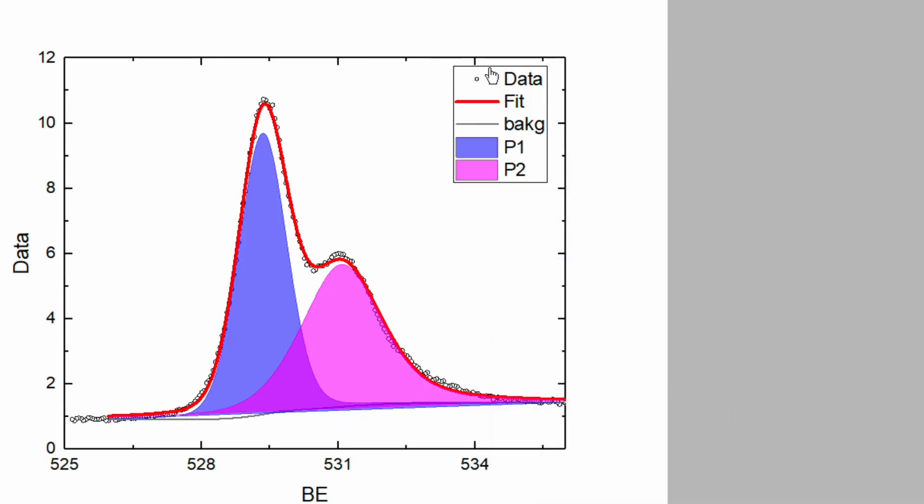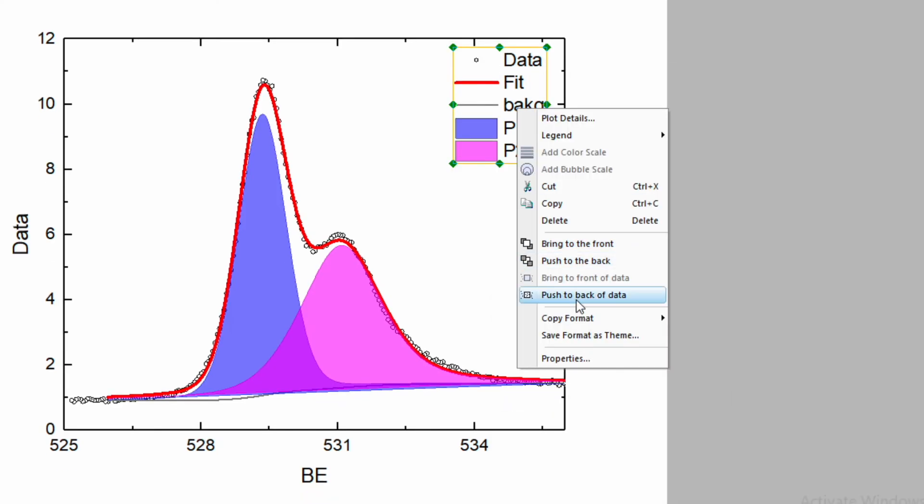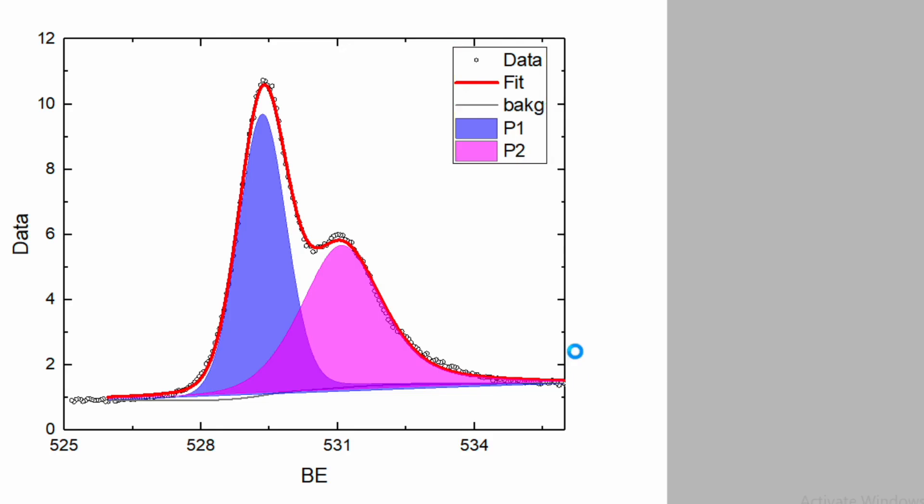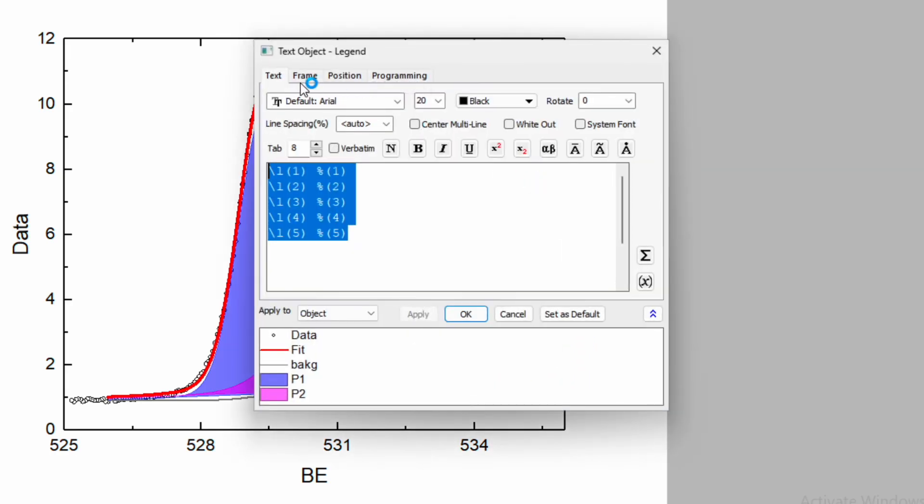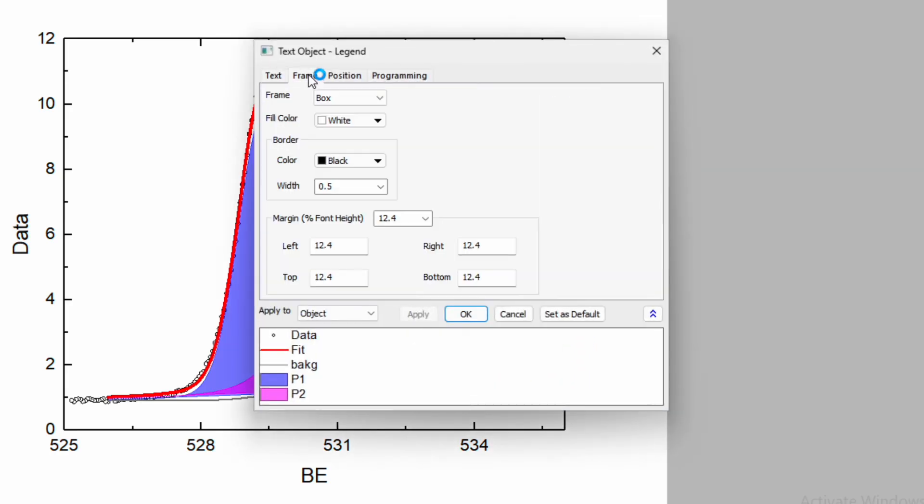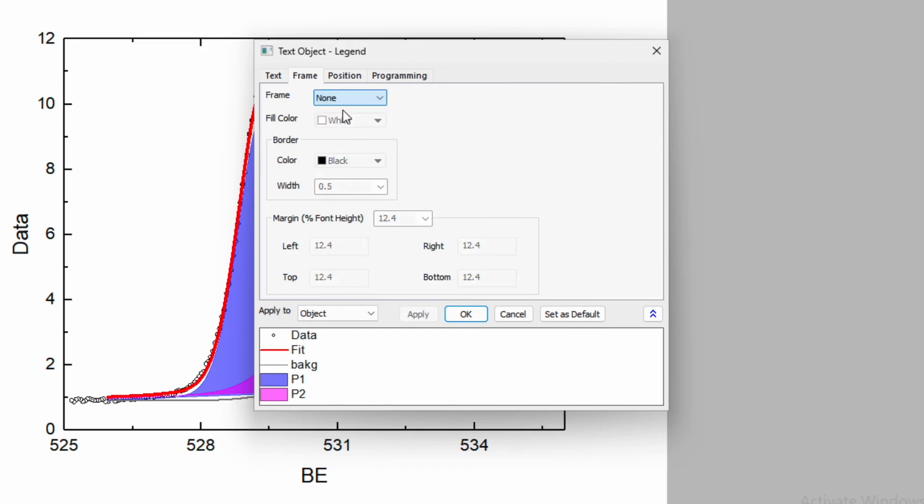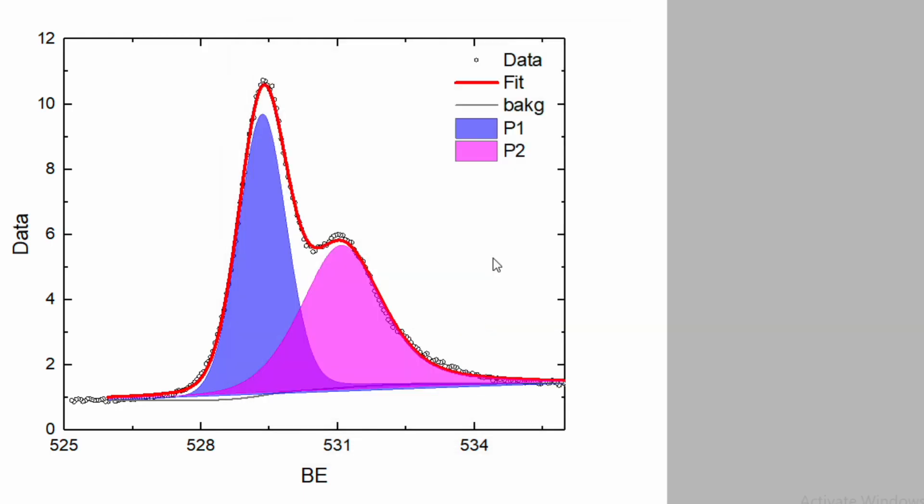Now if you don't want to see this box, right click and go to properties. In the properties you can see option for the frame. In the frame, change box to none and click OK. So the box will disappear.